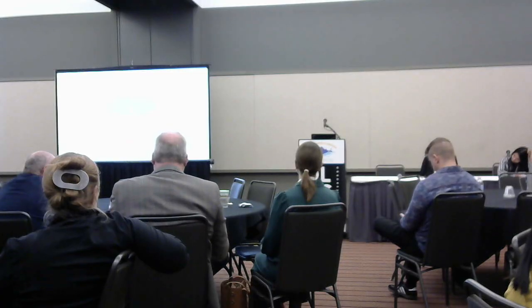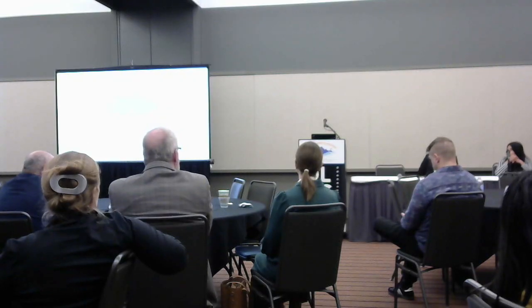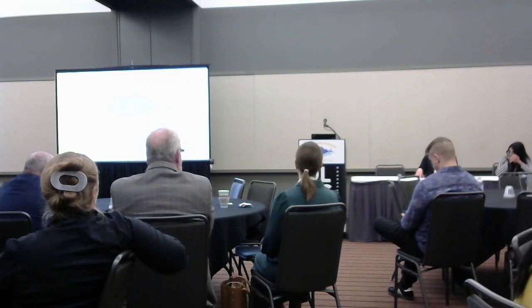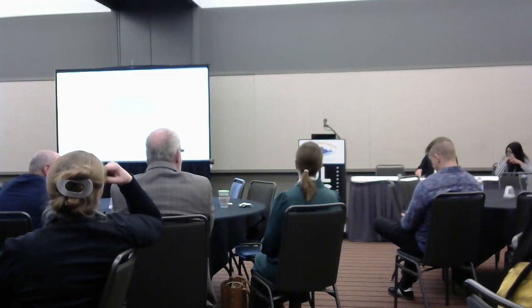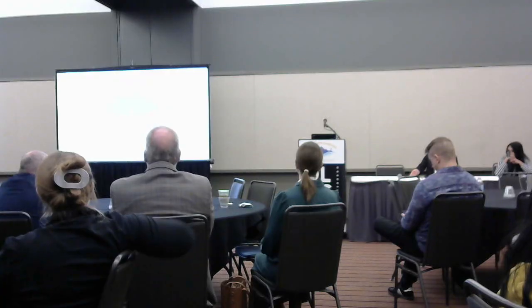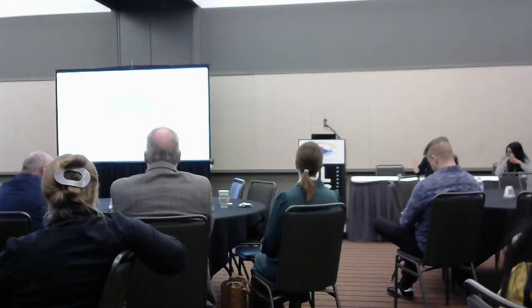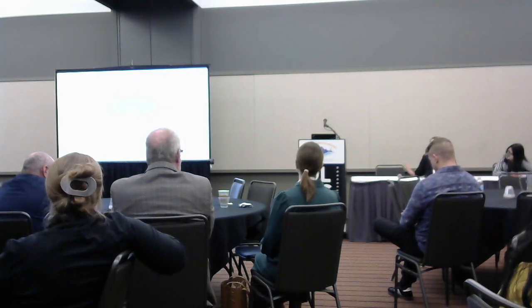I really think the biggest advantage that came out of the workshop that I taught was the order in which I shared information. I didn't go into too much detail, but we started with the foundation of how do we just measure an intensity, and how do we just use the intensity values to do a super basic threshold, and allowed them some interactive time with those basic principles. Then setting that up first and coming back to, okay, what if this doesn't work? Maybe we want to add a smoothing filter or a denoising filter or something.